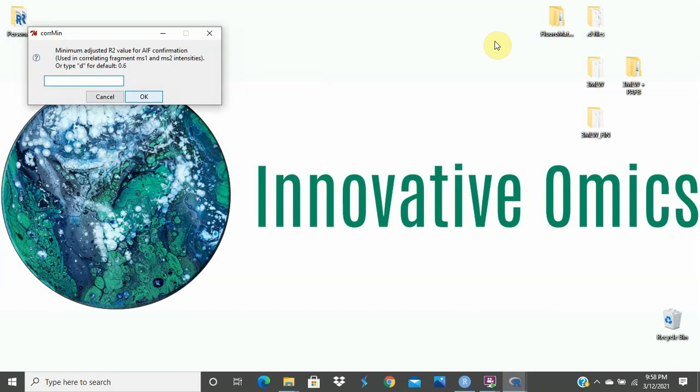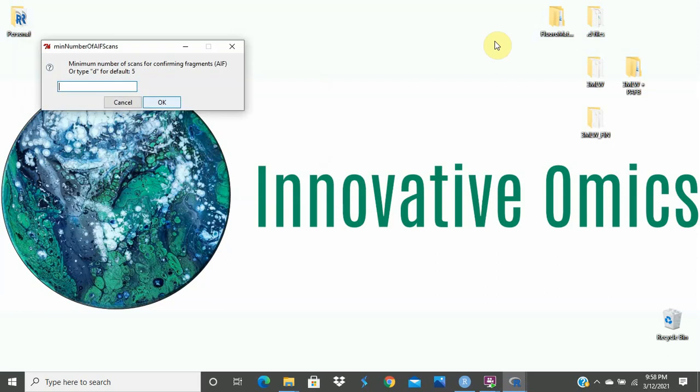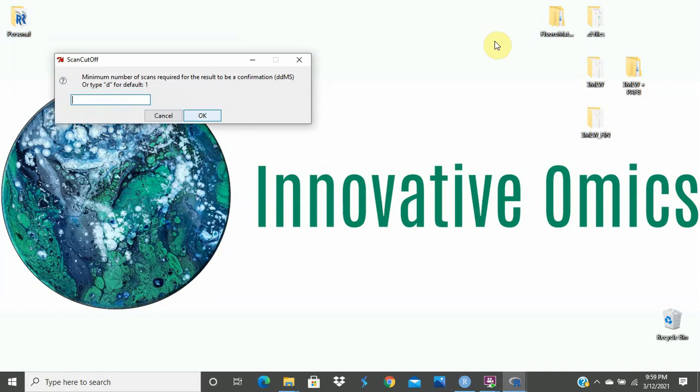Minimum adjusted R2 value for all ion fragmentation confirmation. This pop-up box is not very important. We can input D for default, and this one as well, minimum number of scans for confirming fragments for all ion fragmentation. Not important, we can just hit D for default. The next pop-up box will ask the parameter for the minimum number of scans required for the fragment to be confirmed. For example, do you need to see 3 scans across the peak for confirmation or only 1? This will depend on your instrumentation. In the case of an Orbitrap and for most QTOF acquisitions like used in our experimentation, 1 is sufficient.